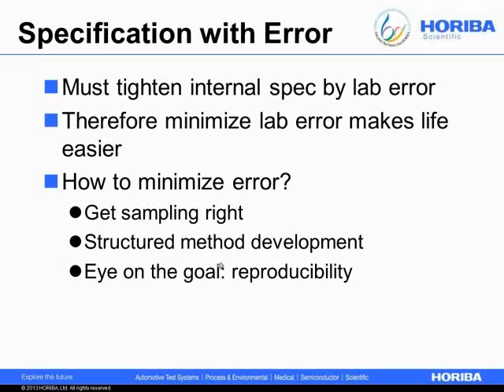And the goal of all of these should always be, whenever you develop a new method, the primary goal is always reproducibility, right? If you can get the same results time and time again, then that will, number one, give you a lot more peace of mind that you're operating the instrument correctly, that it's a good application for your material, but it's also going to mean that you don't have to have the one particle size guru in the company running the instrument. You'll be able to pass the method along to however many operators you choose and feel comfortable knowing that they will get the same result you have.